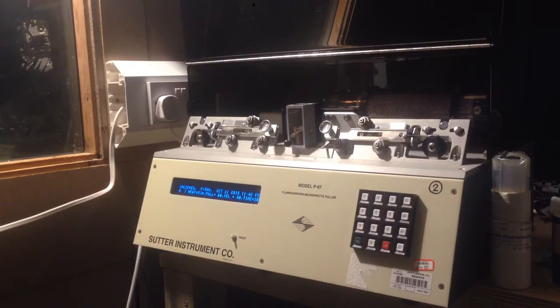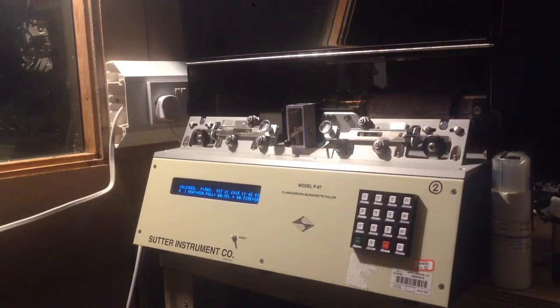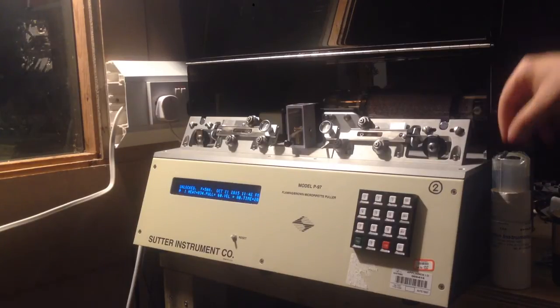Anyway, I picked this up at an auction with a bunch of other stuff but hadn't gotten around to using it. Today I tried it out and, as you could see, I pulled a pipette — whether it's any good I don't know — but I thought I'd do a quick video on the instrument and see if we can pull a pipette actually on video.